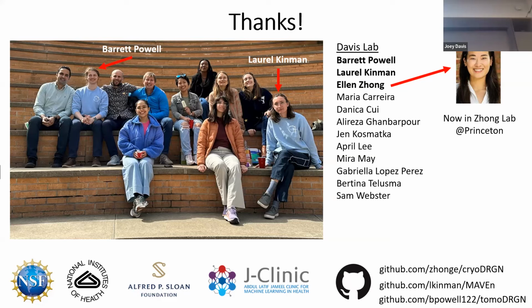We played with this. I had a student who played with this and I'd love it if someone else took this idea and got it to work, because we couldn't get it to work. But the idea was to try to use some of the segmentation algorithms that don't rely on boxes. There's a diffusion box picker that has dynamic scaling of the boxes, and we tried to use that as a particle picker where you could get all types of different particles, and it just never really went anywhere. But people are doing this for image segmentation where you have a big horse and a little rider and you want to pick those separately, so you have 2 different size boxes. So we're trying to adopt some of that.